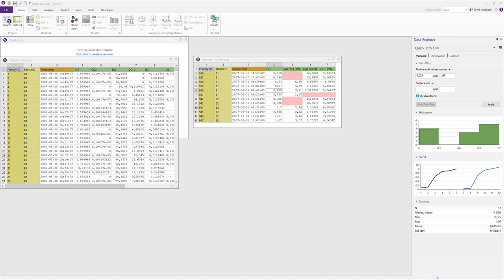The merging in SIMCA will delete the slave data set, so before merging it is recommended that you save a copy of your project. This is due to SIMCA not allowing the same observations to have values for the same variables in two places. So we start by clicking save.